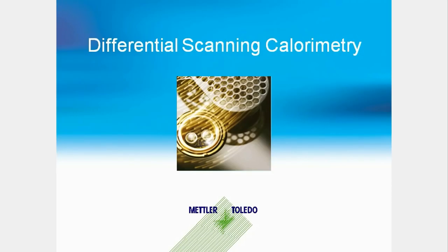Ladies and gentlemen, welcome to this seminar on differential scanning calorimetry, or DSC as it is usually called. DSC is the most frequently used technique in thermal analysis. It is used to study the behavior of materials as a function of temperature or time. Melting points, crystallization behavior, and chemical reactions are just some of the many properties and processes that can be measured by DSC.